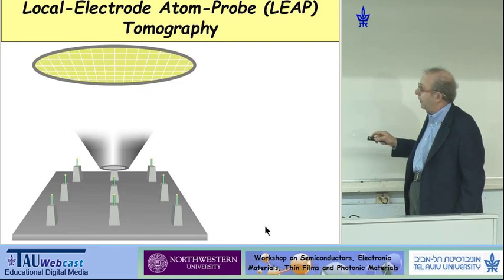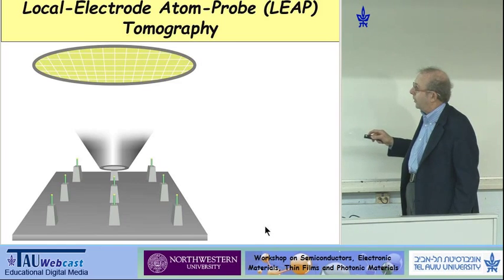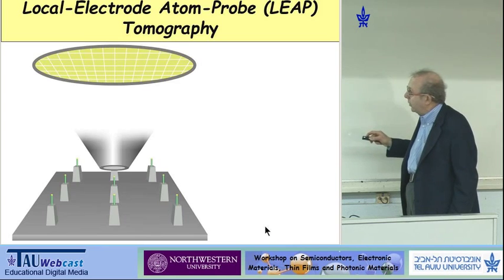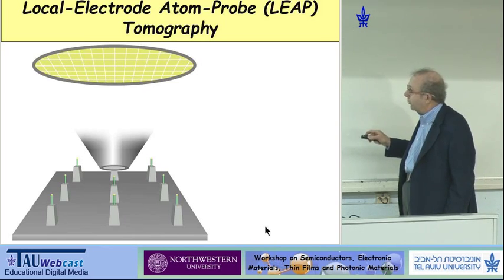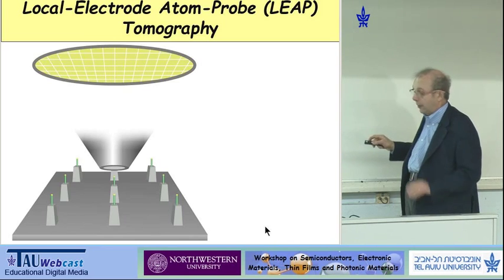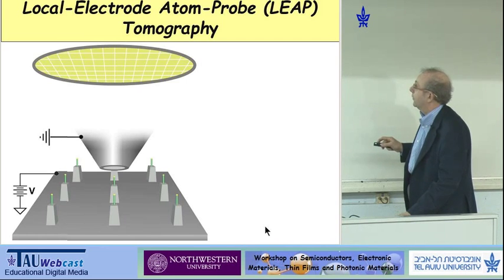So say this is a silicon nanowire. Here's a little bit of gold. It was grown by the so-called vapor-liquid-solid technique. You bring this quite close. This orifice, this opening, is of the order of maybe 40 microns or so, and you want to bring it to within 40 microns because that enhances the electrical field, and you don't have to use such large, high voltages.